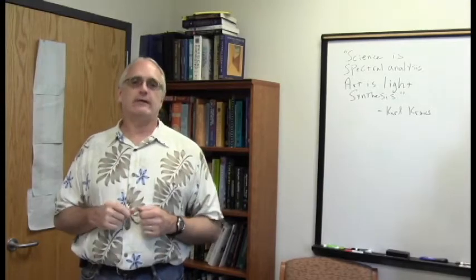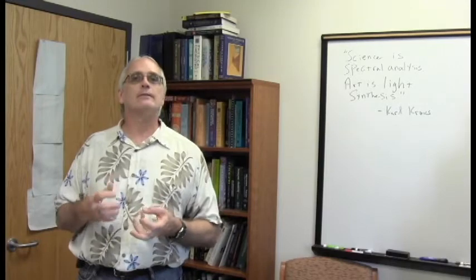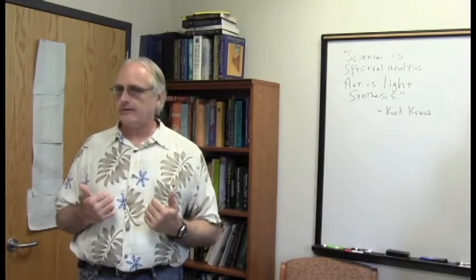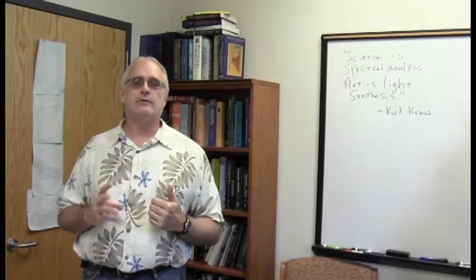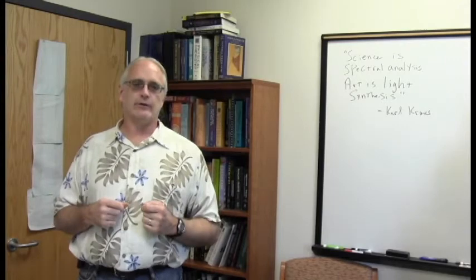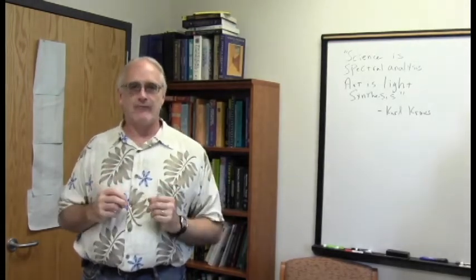In the 1 second of time it takes us to acquire the carbon, or at least one pulse of a carbon spectrum, the protons that may be attached to those carbons have oscillated between their spin states so often that what the carbons will essentially, quote unquote, feel is the average.